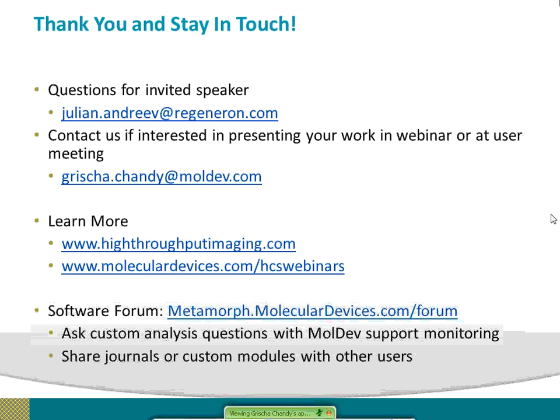Looks like we answered the question for the speaker. The next question is, have you multiplexed the EPIC screen with HCS? Sounds like you did some comparison. We did some comparison, and they were comparable. That's how we actually realized that what we are measuring with EPIC is spreading. We took an EPIC plate, we saw spreading actually happen there by microscopy, and we could measure the increase in cell index. Those two things correlated.